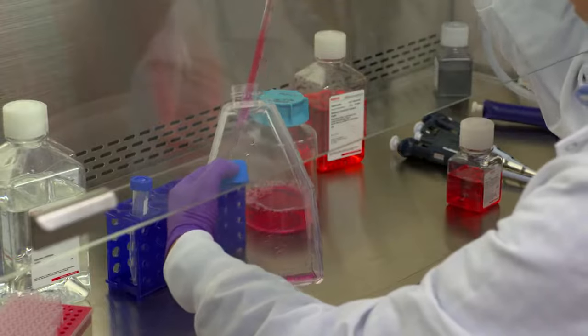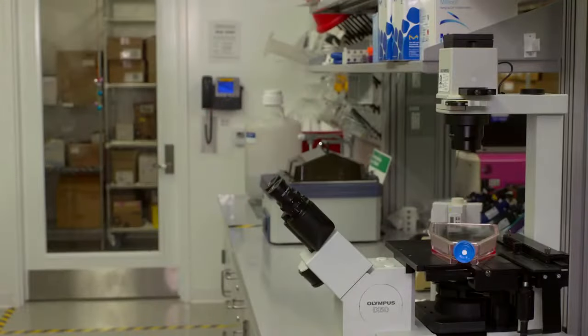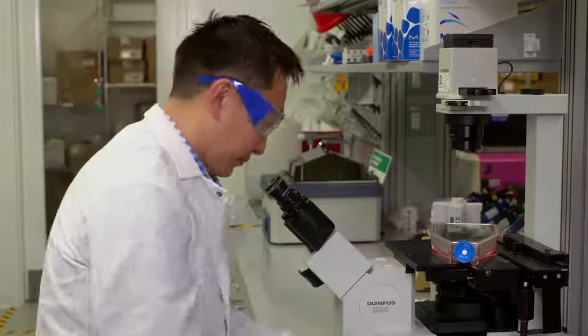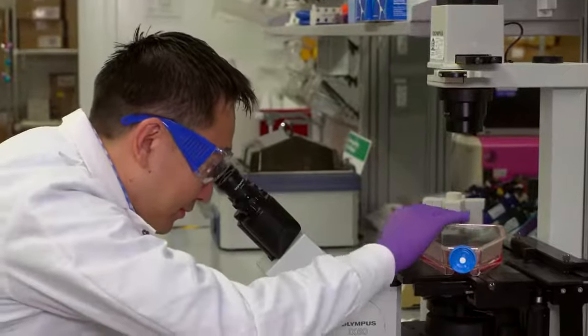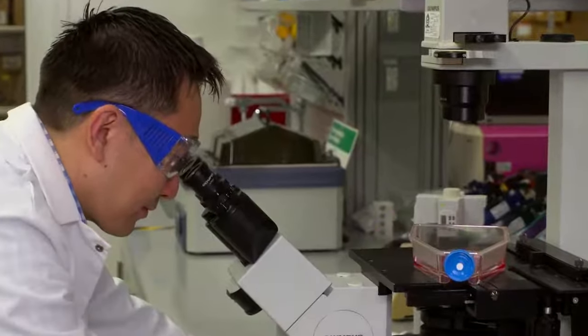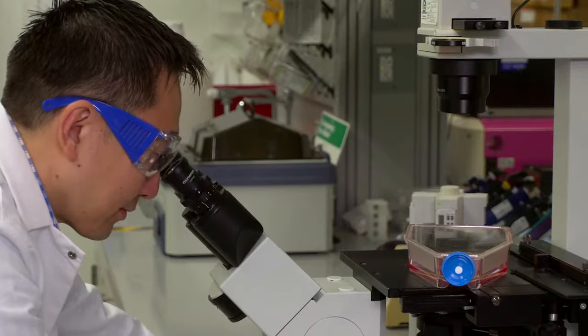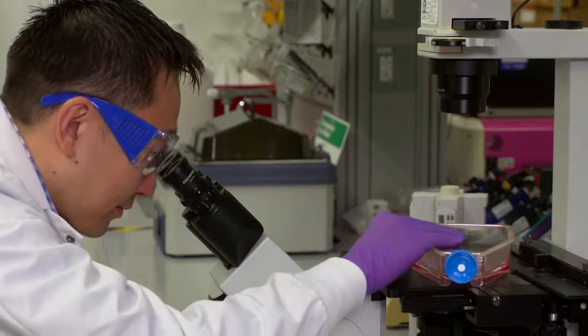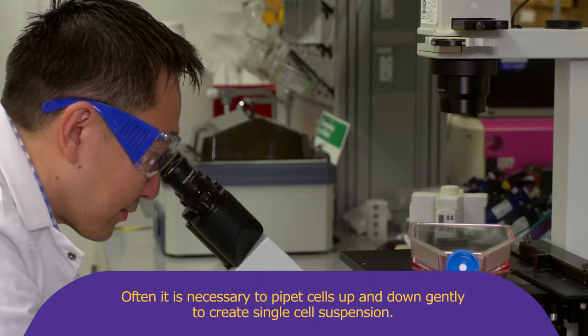Gently pipette up and down to break any cellular clumps. Examine the flask under microscope to ensure a single cell suspension has been achieved. In some cases, it may be difficult to obtain single cell suspension depending on cell type. In such cases, it will be difficult to obtain accurate cell counts. It is necessary to pipette cells up and down gently to create single cell suspension.